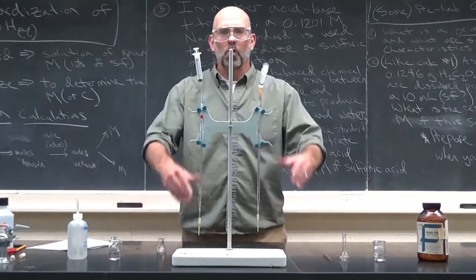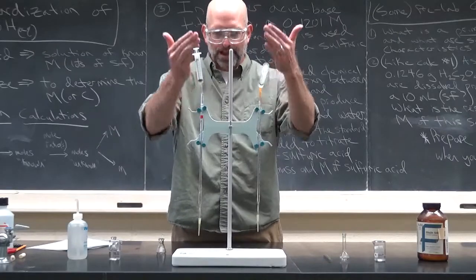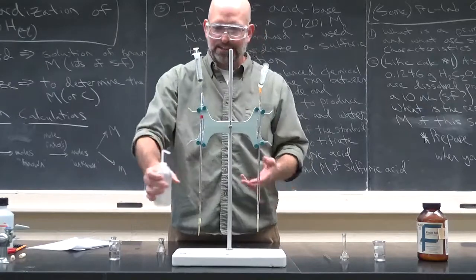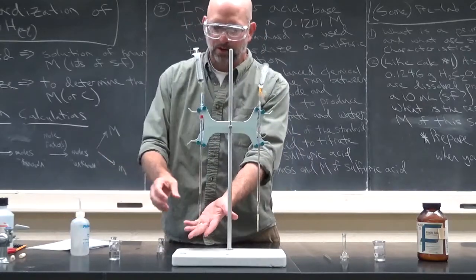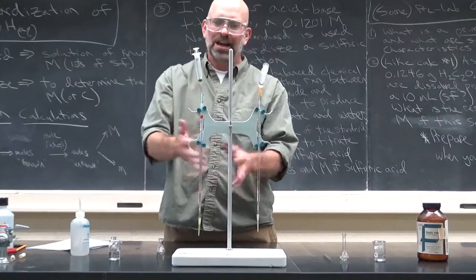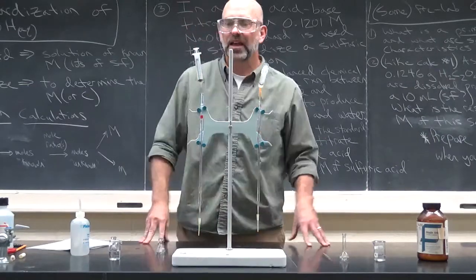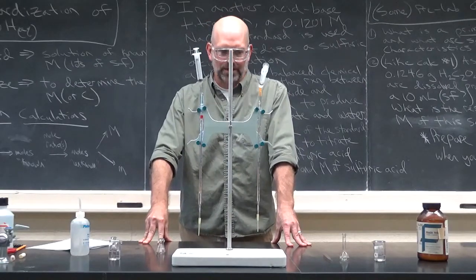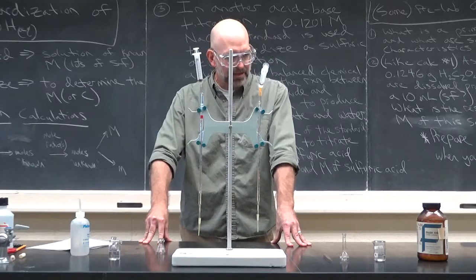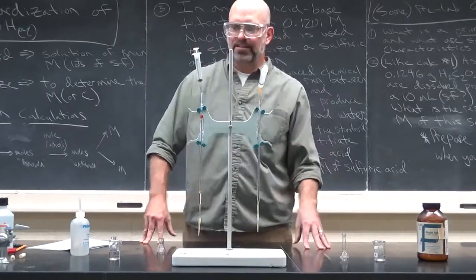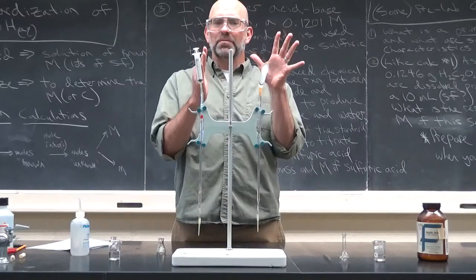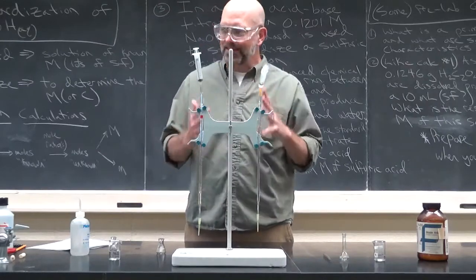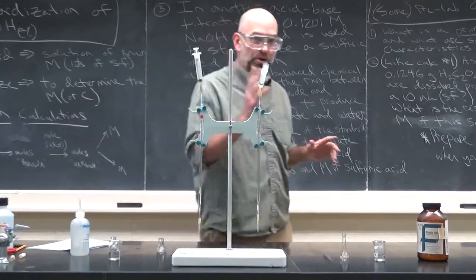Okay, the procedure also says that you want to rinse the micro-burette with water before you do anything. I'm not going to show you that. You can take the syringe off and rinse it down with water, or put a beaker of water underneath this and pull water up into it and push it. Okay, so you rinse it with water before you do anything. Then you also rinse it with the solution you're going to fill it with. Okay, what does that mean?